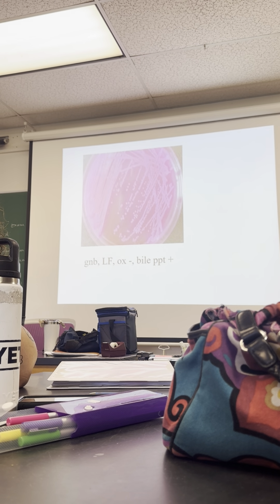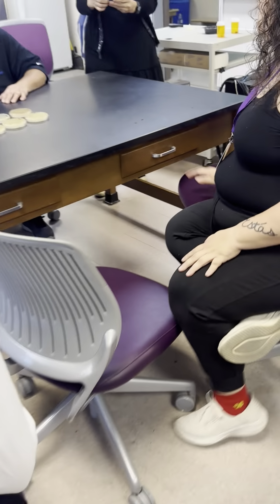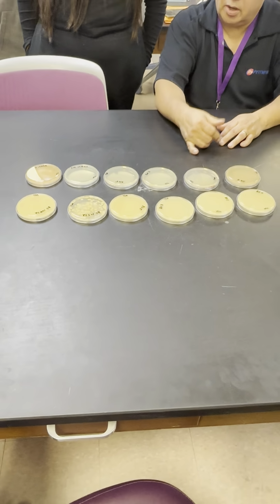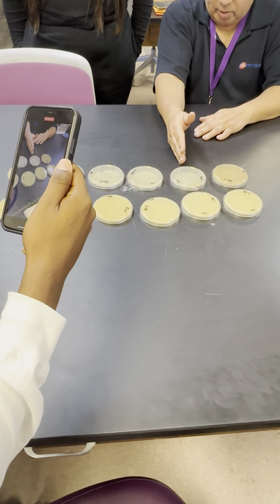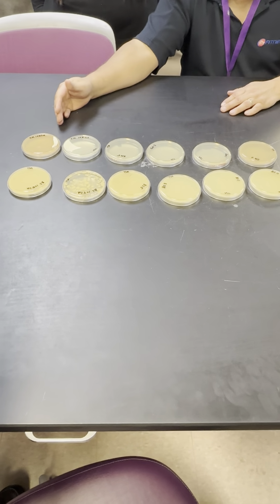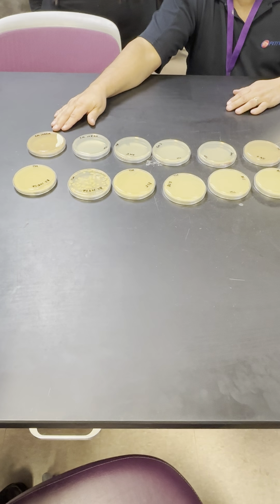All right, y'all come on over here. This is my assay for the UV. This is Serratia marcescens on this side. That's Bacillus subtilis. I did a Kirby-Bauer and made a lawn for everything. I did it at 0, which is the control. I did 1 minute, 3 minutes exposure, 5 minutes exposure. Then I did 2 sets of plates at 10 minutes. One of the plates did not have the lid. The other plate had the lid. Okay?